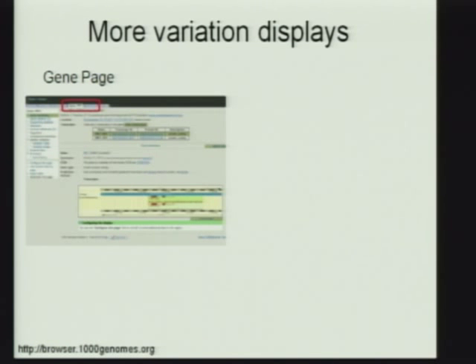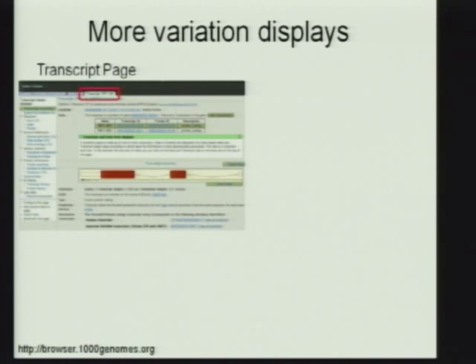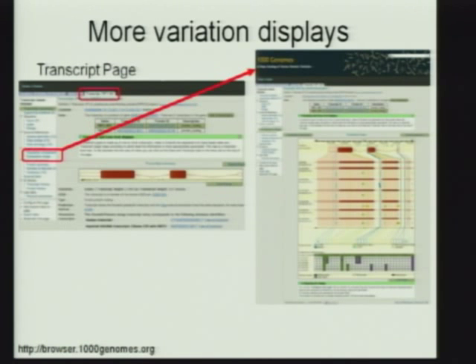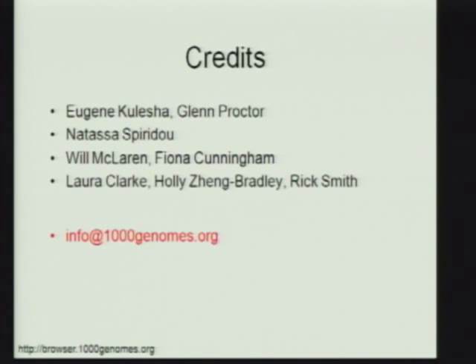There's a whole host of other variation displays where variation is incorporated into different things. If you're on the gene page, you have an area on the side where you can get to variation information — this actually shows you variation information in the context of protein domains, so how protein domains are affected by the variation sequences. On the transcript page we have a couple of different displays showing how the trio information affects the transcripts — these are each of the six trios — and all the synonymous and non-synonymous variants in the transcript. With that, I just want to acknowledge a few people at the EBI who built the back-end databases and created this Ensembl-based browser for the 1,000 Genomes.